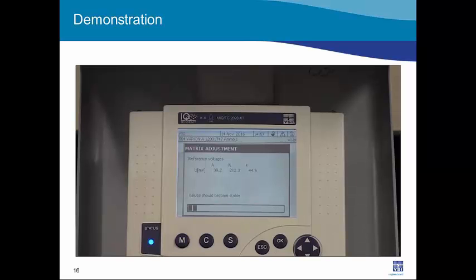But you go in there and you push start, and right away you can see that the system is measuring the reference voltages for you for ammonium, nitrate, and potassium, and it's recording those values for you. So that's the convenience of the IQ SensorNet, those millivolts are being stored in the system for you. It just takes a few seconds here for those measurements to stabilize. And so this is basically setting the reference condition in the first step.